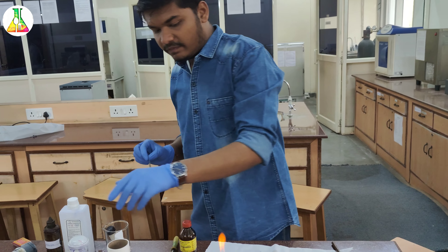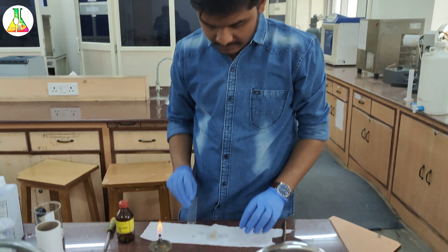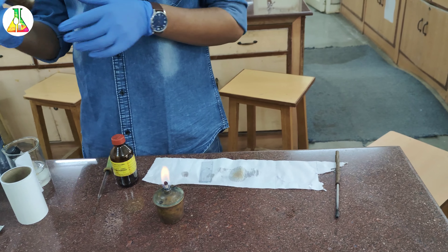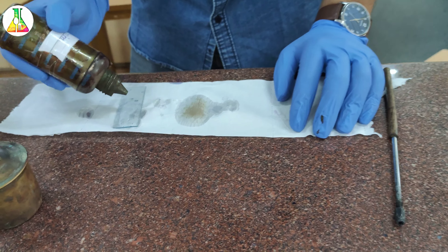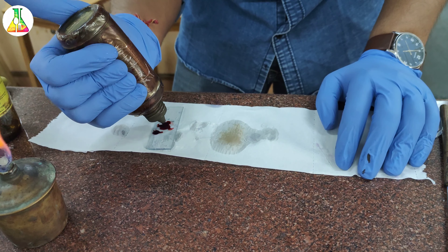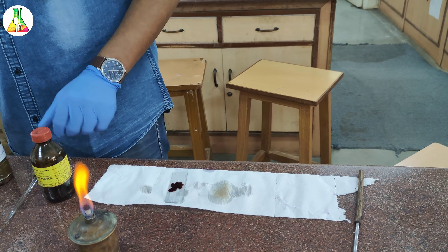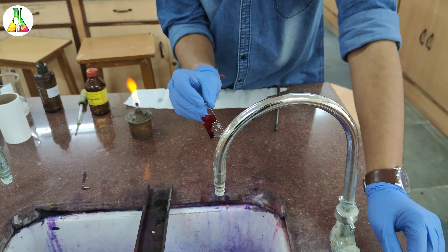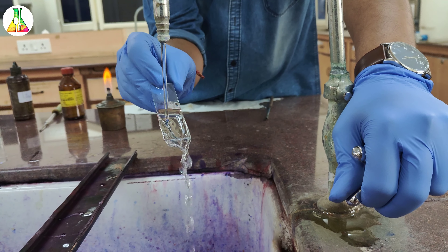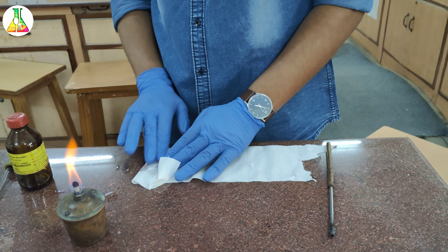Let us see what we are going to do and what all we need for conducting Gram's staining. First of all we will need the basic things like our sample, which is buttermilk. We will need a tissue paper, spirit lamp, and a matchstick. The bacterial loop will be used to make the bacterial smear. Among the reagents we will need the crystal violet dye — the first basic dye — followed by Gram's iodine, then 95% ethanol, and the secondary dye that is safranin.